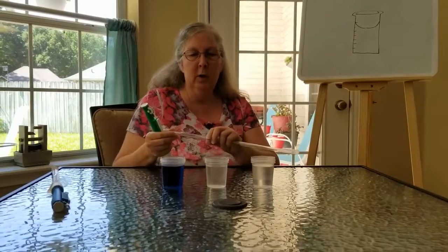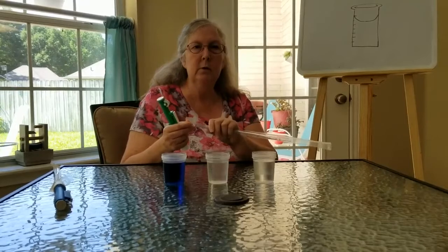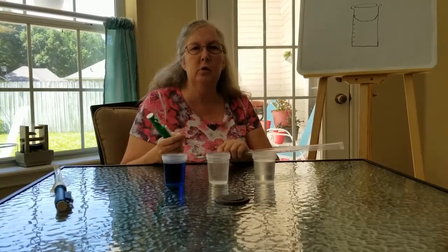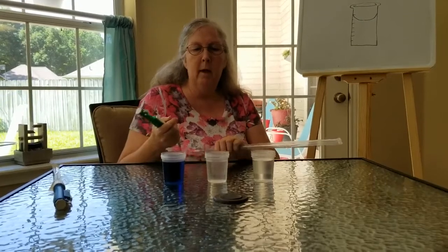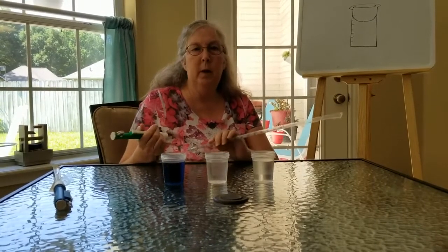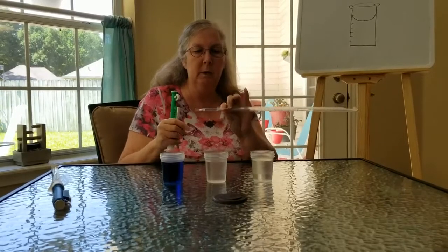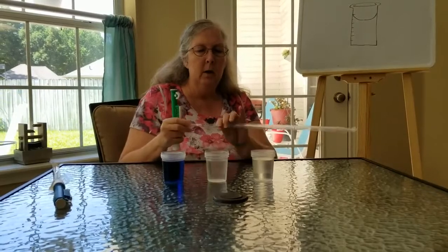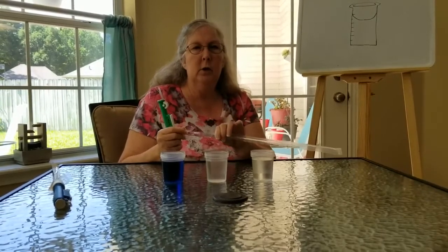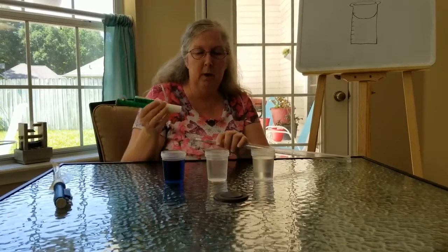Okay, we're going to show you how to transfer different solutions. This may be a sterile solution, or it could be a solution, say a broth with bacteria growing in it. So for that, you're going to have to use a pipette, which is one of the main things that we use. We have different size pipettes. This is a 10 mil, we have a 1 mil, there's 5 mils. They usually are packaged in sterile packaging, and then this is a pipette aid or a pro pipetter.